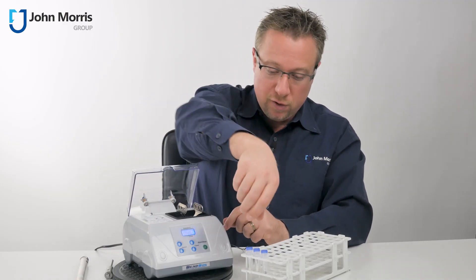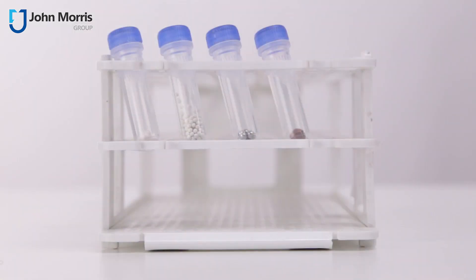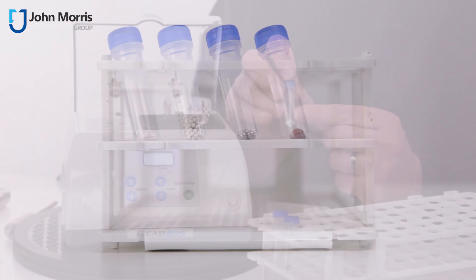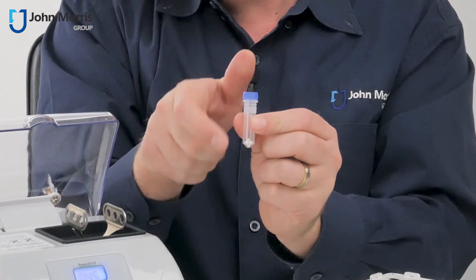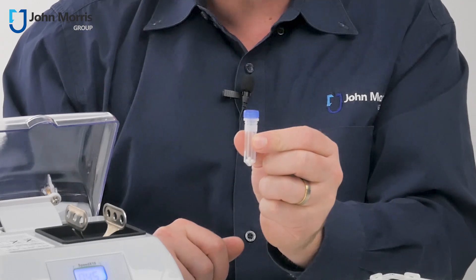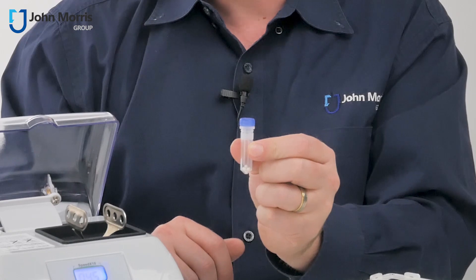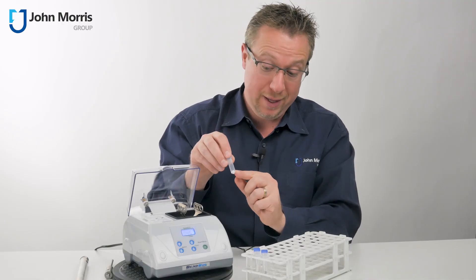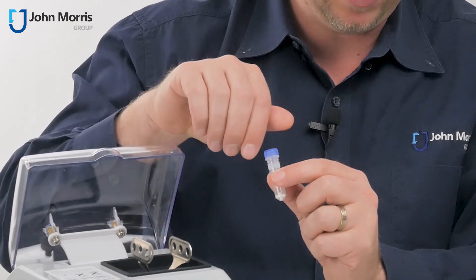Here's how it works. First you need to choose the right combination of beads for your actual sample. These are available in a range of sizes from 0.1 up to 6 mm — that is the beads — and they come pre-packaged in a little resealable container like this. They range in price between $300 and $500 for a pack of 50. Once you've picked your bead size, you load your sample in solution directly, close the cap, and away you go.